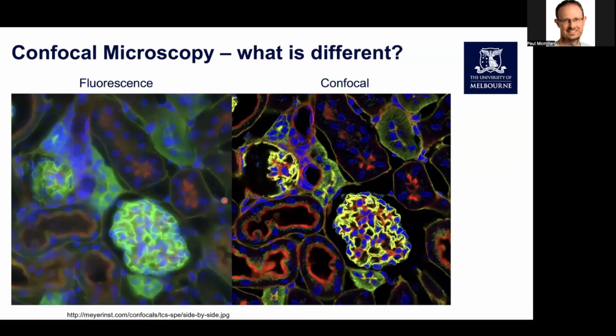One thing I did want to highlight is that these basic fluorescence microscopes are still very powerful, so they're a very good way of collecting light. I often tell our researchers to try and optimize their stains as much as possible on a basic fluorescence microscope. It's a lot faster and a lot cheaper to do that than to try and use a confocal for optimizing your stains. You can still get really fantastic data off a very basic fluorescence microscope. You would potentially come to a confocal system when you want to get that higher resolution, higher quality image.